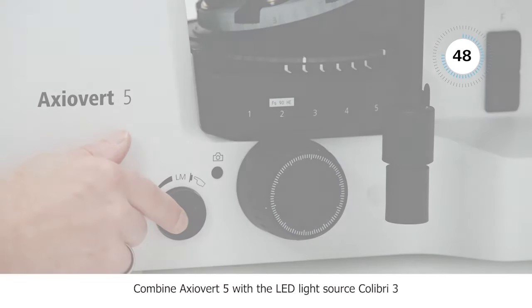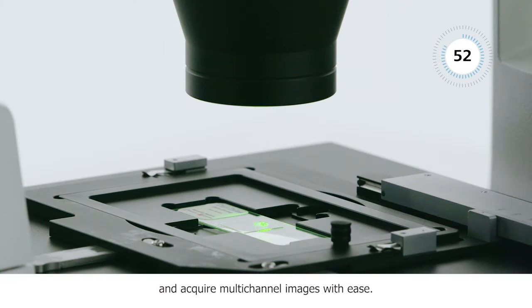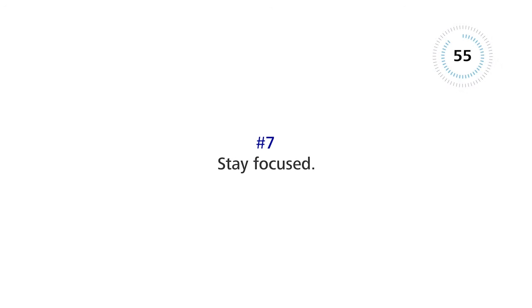Combine Axiovert 5 with the LED light source Colibri 3 and acquire multi-channel images with ease. Keep your focus on your sample.